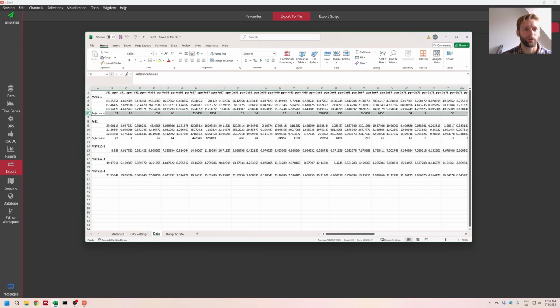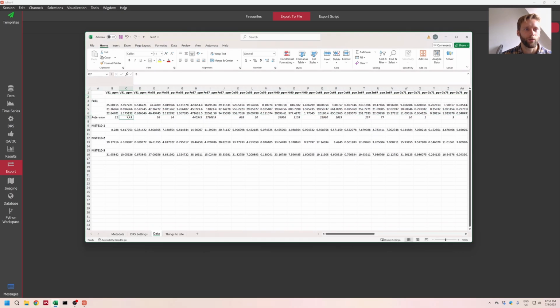What we want to pay more attention to is our standard that we measured that isn't a calibrating standard, that we measured as an unknown. So if we do a good job at reproducing these values, then that's something that we can be very happy about. So that's good.